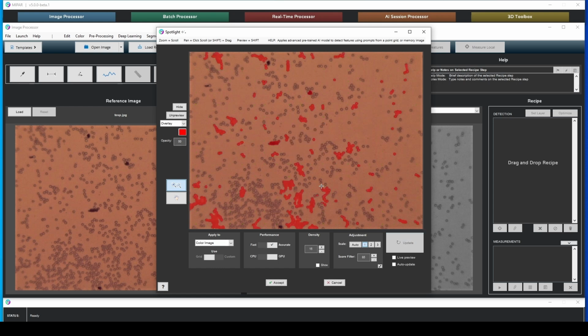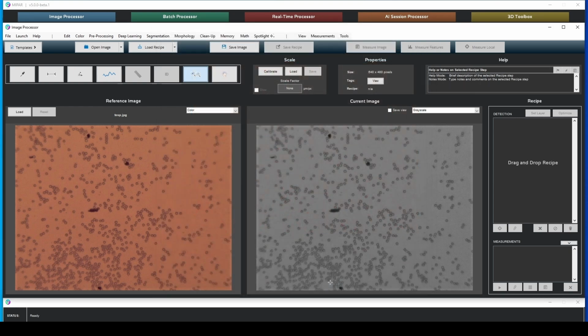So we can first go about by finding these specific seed points and then running Spotlight locally on a localized area using our box method. So in order to get these seed points, we need to do some preliminary steps. This will help us create these seed points initially and get us a cleaner image to work on.